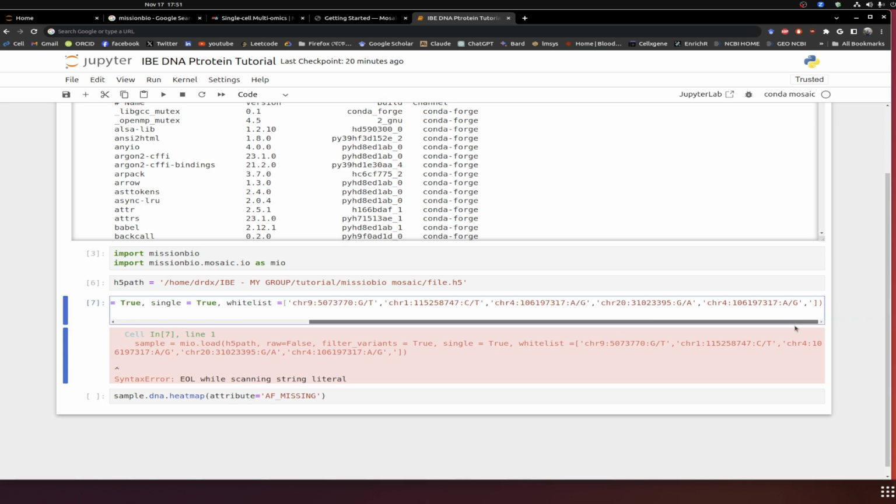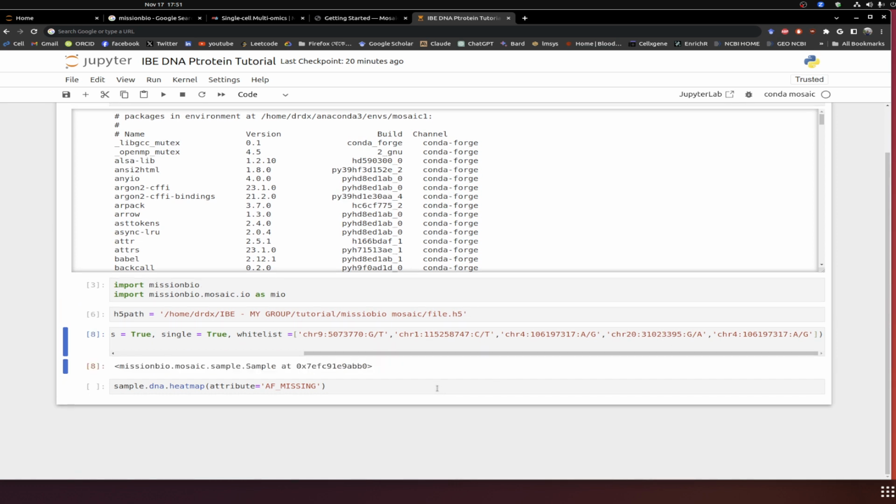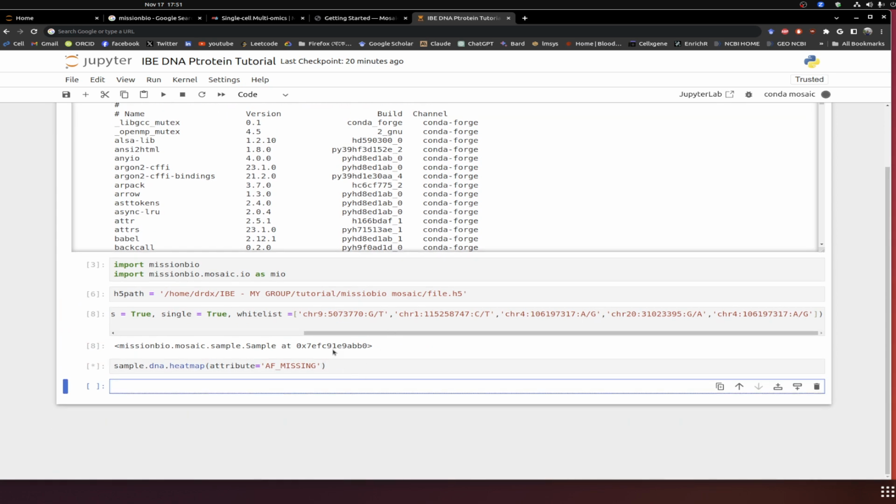There must be some mistake somewhere. Okay, see. Yes, that's the mistake. It looks fine now. And you can come in here and make it. So this is the basics.